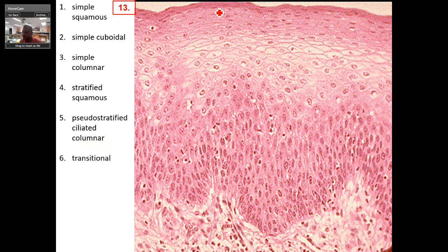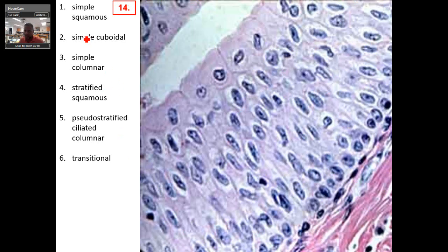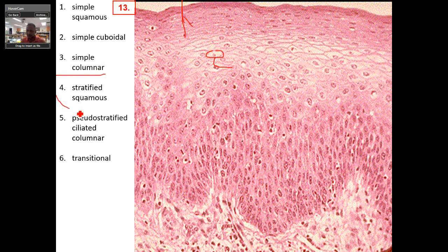See this? From here down to here, these are all stratified squamous cells. You can see the squamous cells layered. Remember, your apical surface is your determining factor for telling what type of stratified layer you're looking at. That last one was stratified squamous.